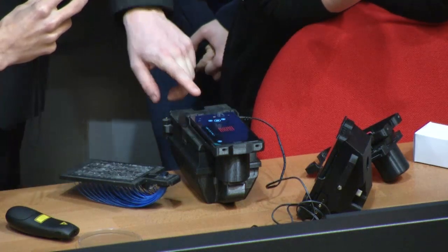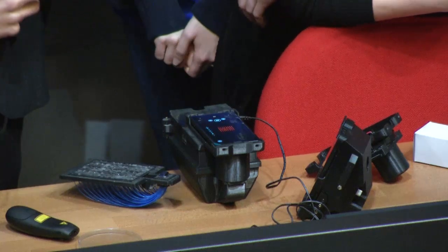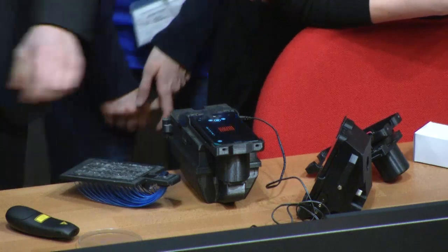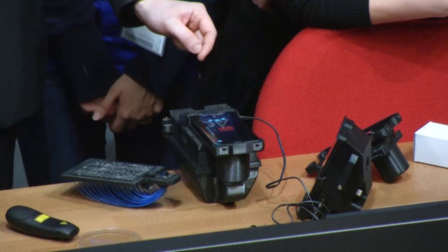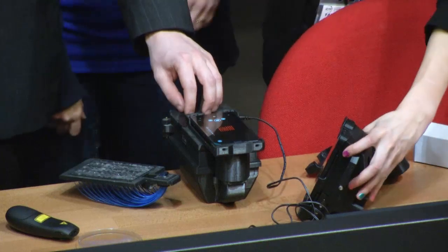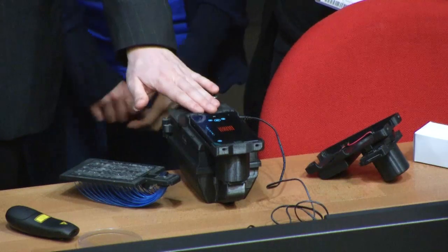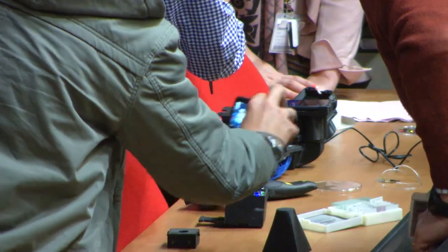Colorimetry, yeah. And we actually do have a fluorescent-based reader as well. And the illumination can be adjustable? No. So there are, let's see, 20 LEDs or something like this here, red LEDs. So making those modular is very difficult. So this device is for a specific ELISA test, which if you were doing a lot, you know.